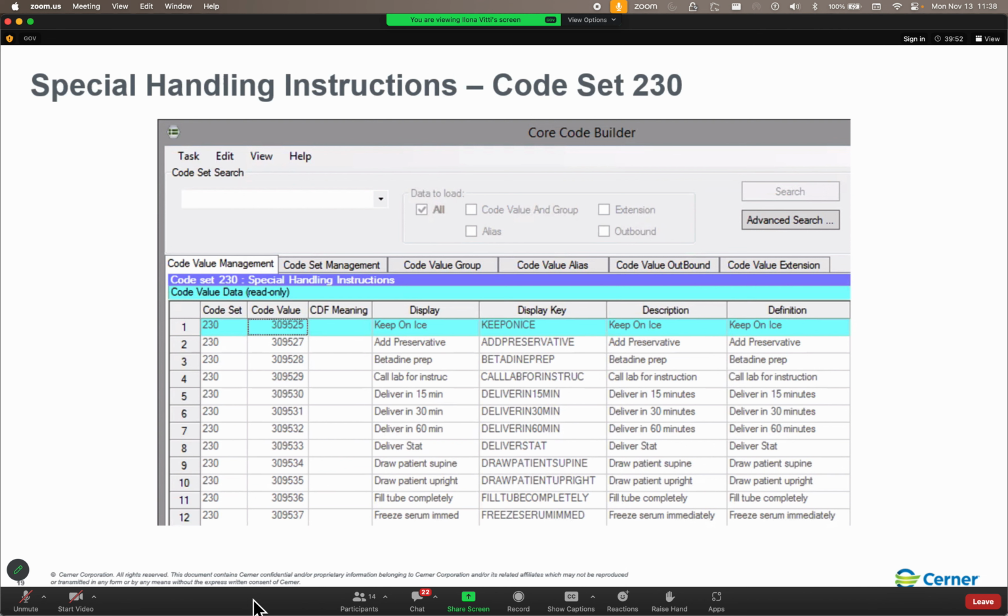This would be the way that I would find some things. If I didn't know the reference page right off the top of my head, then I would do exactly what I just did. Get to a page that I know is in specimen management and then do the search within that set to see what comes back and then go from there. Okay.